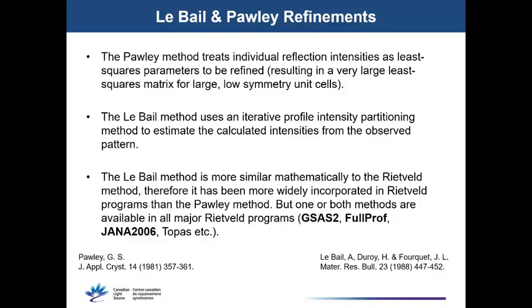Personally, I've almost always used the Lebail method based on the software packages that I've used the most. But both methods can be good ways of doing it. And the contrast in the way they work can actually sometimes be helpful as well for structure solution. Oh, and Bob has got a comment here. There's something else that's different about the Lebail method versus the Pawley method. The Lebail method is for one phase in one data set.